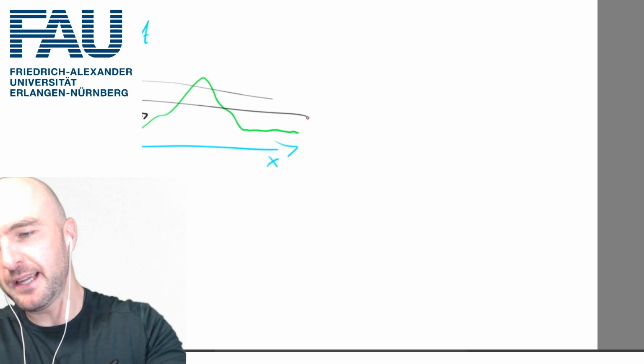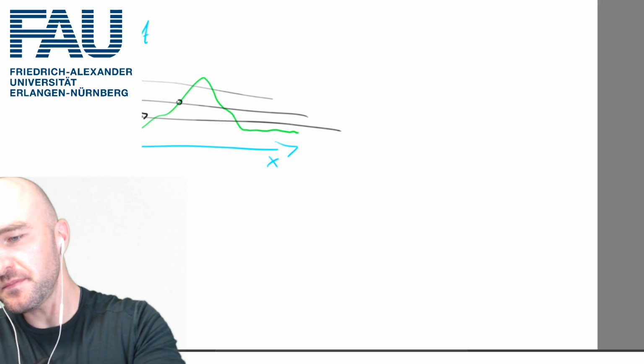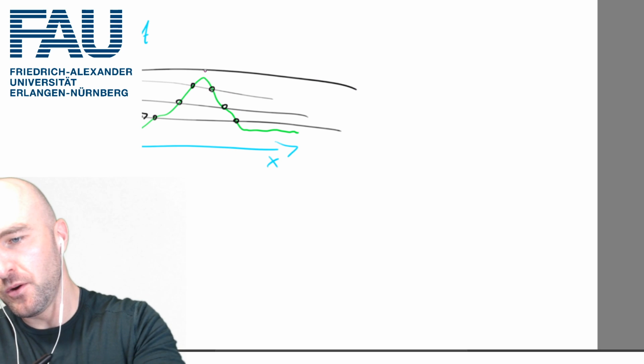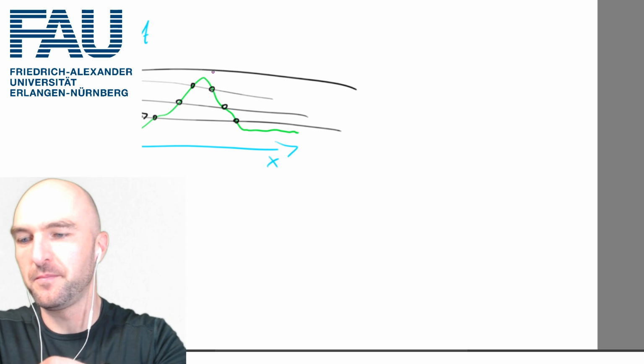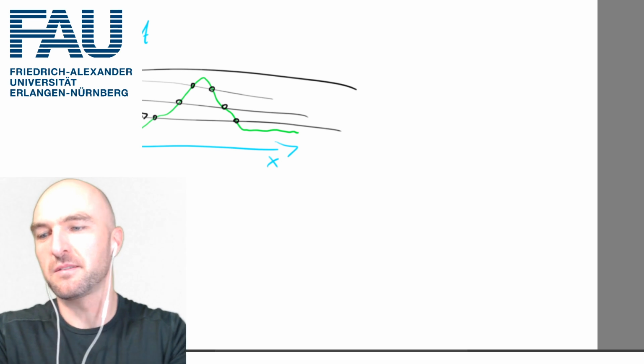And what that hiking map shows you is essentially locally what altitude you have. So this might be 1,000 meters, this might be 2,000 meters, this might be 3,000 meters. And in Austria there's nothing with 4,000 meters, so 4,000 meters is up here.